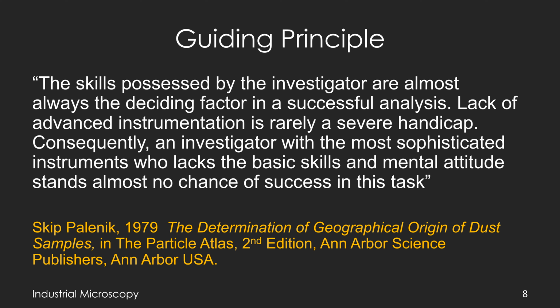Skip Palenik, who is the founder of Microtrace and, I don't think it's hyperbole, one of the world-renowned forensic microscopists, also taught at McCrone Research Institute, and I took a couple of courses from him. Back in 1979, he made this point, and I think he said it quite well, which is the limitation is often not the instrumentation, rather it's the experience and the skill of the operator. And although knowledge and understanding we can help get with books and with videos and listening to talks and reading journal articles, in the end you have to spend a certain amount of time actually practicing these things in order to get good at it.